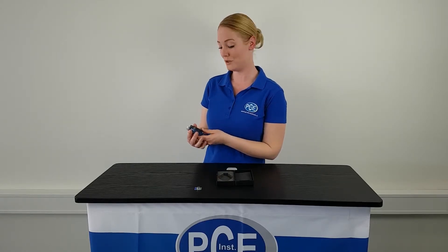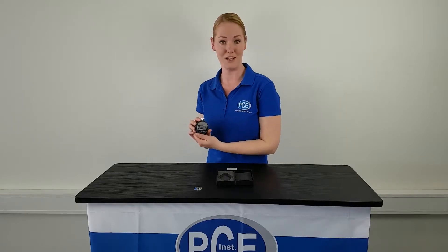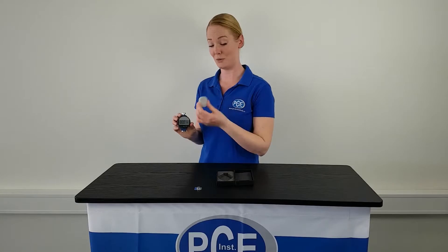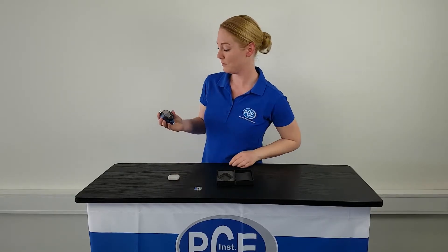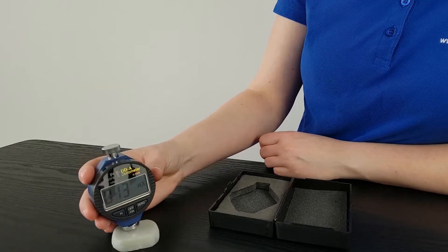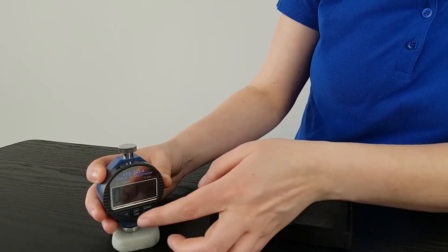The measuring device is started by pressing the ON key, and the device is ready to use straight away. As a test material I have here an eraser. I press the measuring device onto the eraser, and when the value is stable I press the HOLD key.